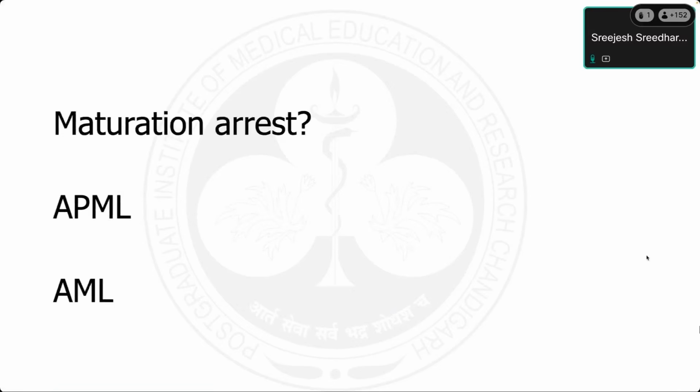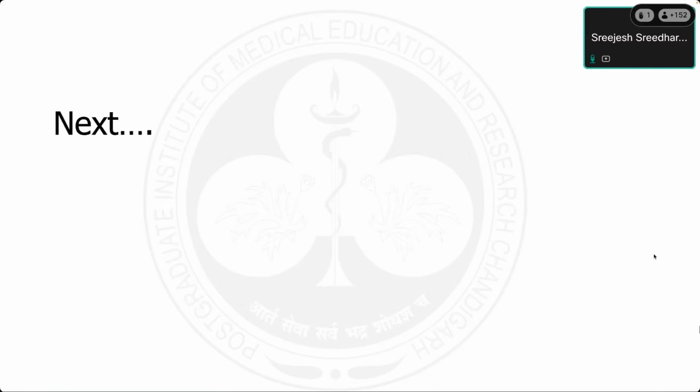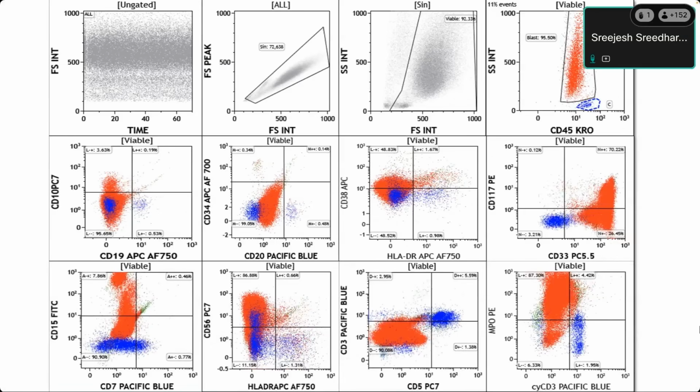Okay, and next we did flow cytometry. So this is a classical appearance of the promyelocytes in flow cytometry. They had very high side scatter, right? Usually the neutrophils lie in this area, but here all the cells are lying in the same region as neutrophils with a very high side scatter, an inverted teardrop or whatever you can call it. And another feature is that even without putting an antibody, they will show autofluorescence in all the channels.